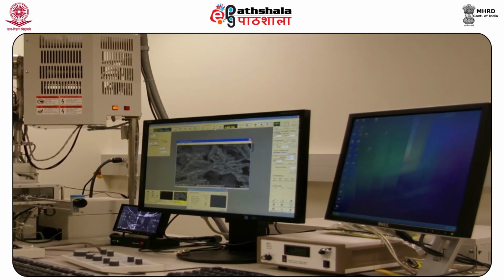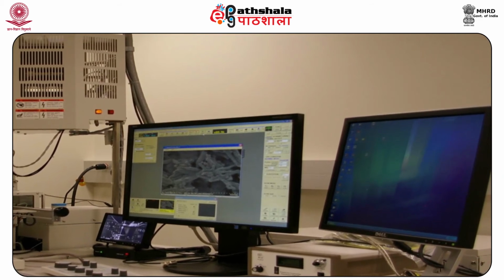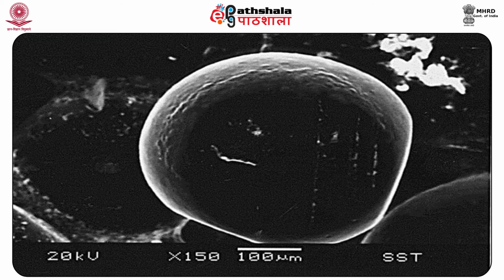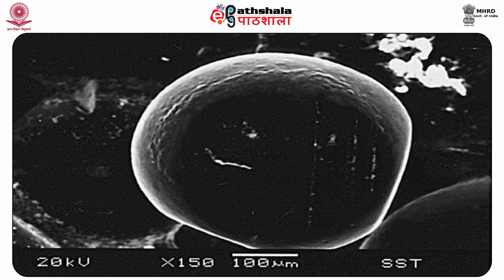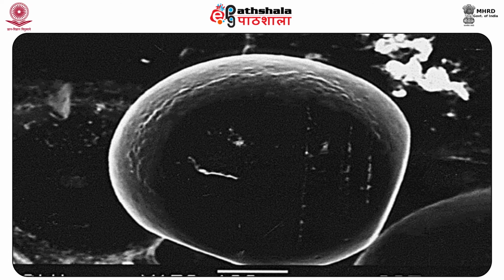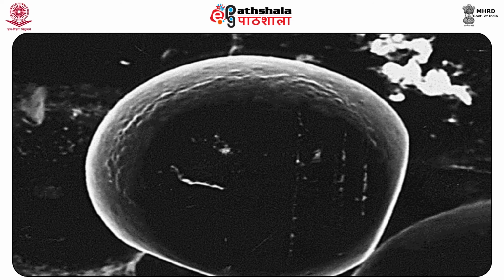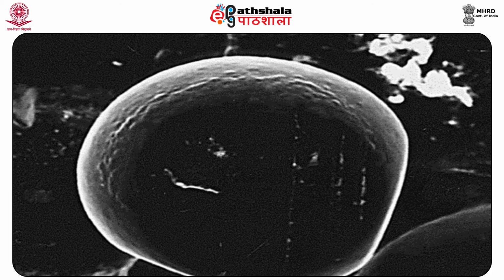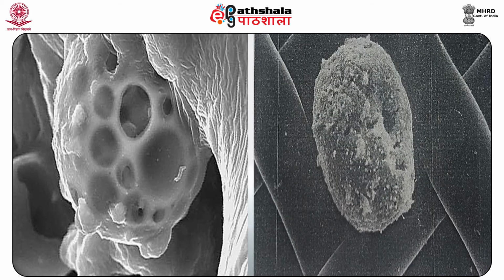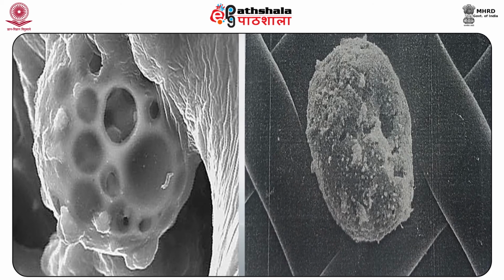These particles can be characterized by their size, shape, and elemental composition. As shown in the figure, when the sample of gunshot residue is exposed to a beam of electrons from a scanning electron microscope, X-rays are emitted. These X-rays are passed into a detector where they are converted into electrical signals. These signals are sorted and displayed according to the energies of the emitted X-rays.